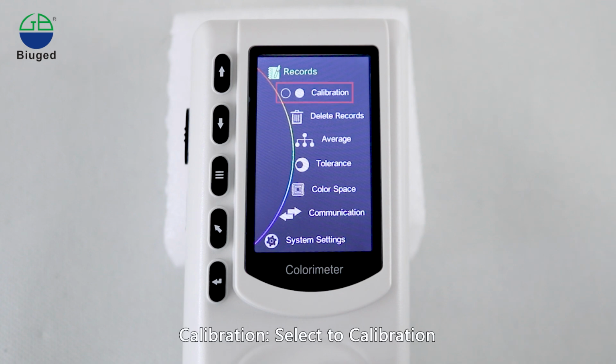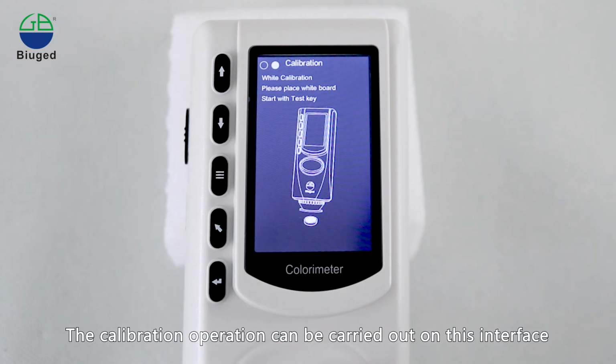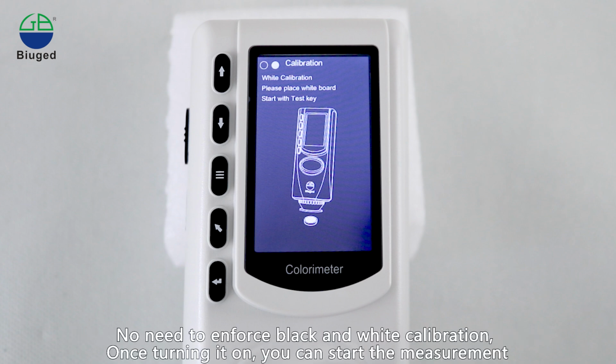Calibration, select Calibration. Click the Enter button to go into the calibration. The calibration operation can be carried out in this interface. There is no need to enforce black and white calibration. Once turned on, you can start the measurement.